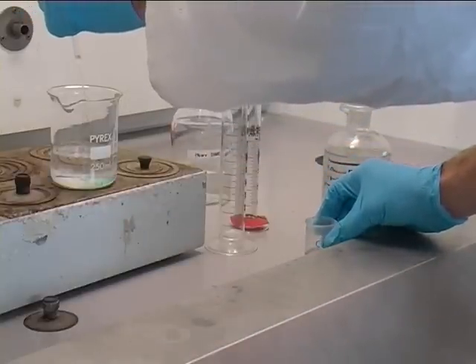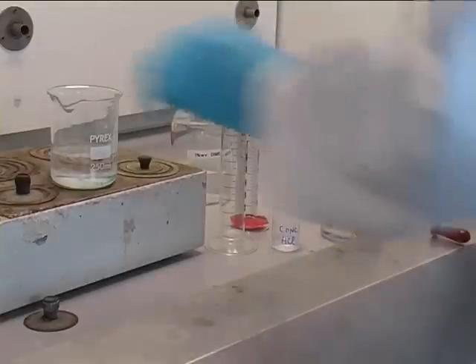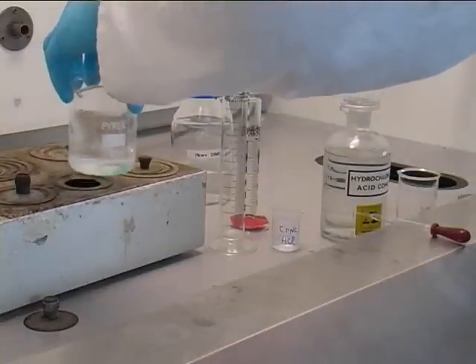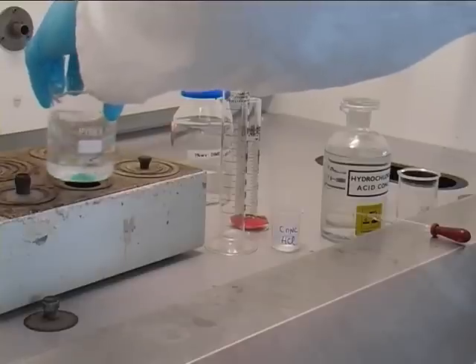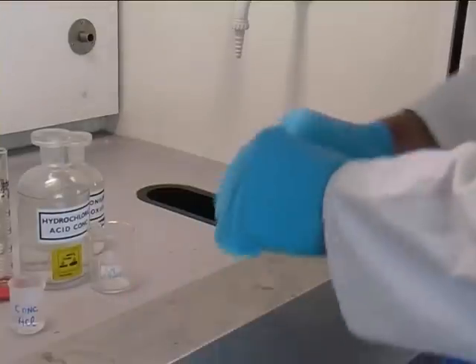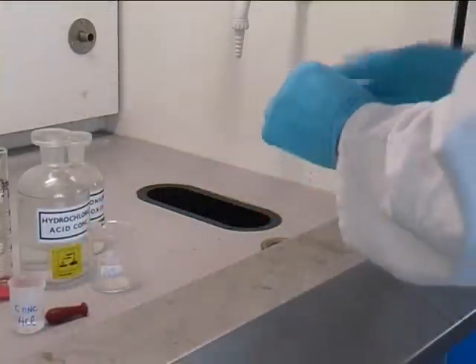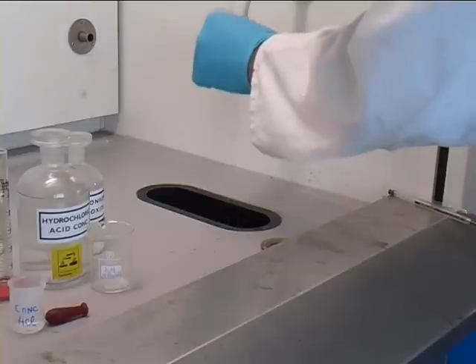It is important when using concentrated acids that gloves are worn. Mix the compounds together and put back onto the steam bath. Wash any pipettes that have had concentrated acid in them with water and then place in a glass bin.